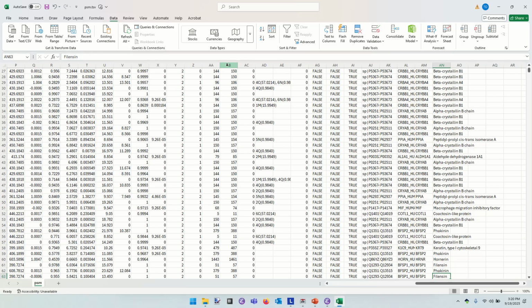So the bulk of your data will still be identifiable by a conventional search engine, quite apart from the cross-link ones. So yes, you could use open search as a way to go after glycans of unknown size. But you will end up with a pretty massive search base, I guess. It doesn't slow things a lot to do that.